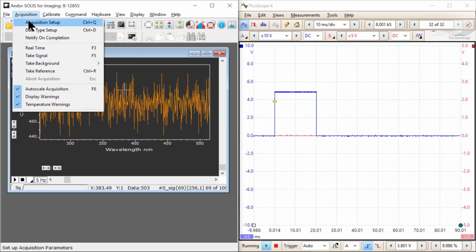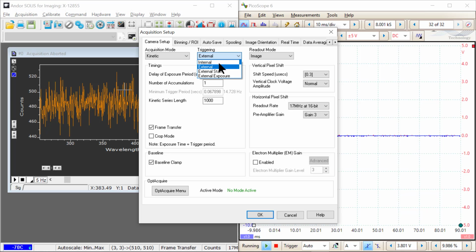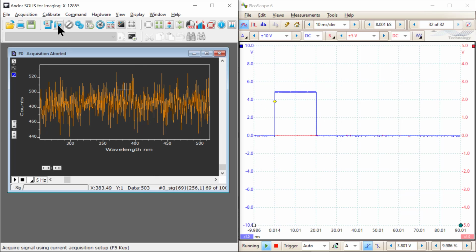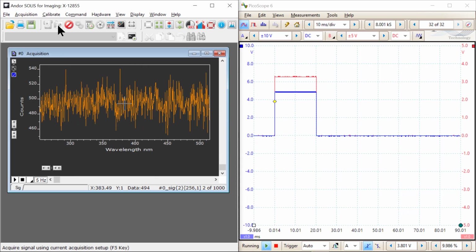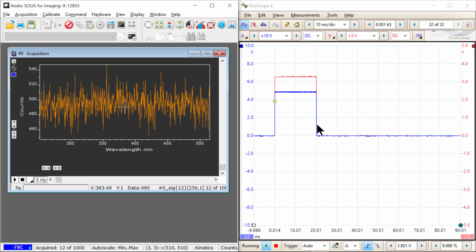So what I can do is switch to a different mode if I want to actually define formally my acquisition time, or my exposure time, just from the trigger pulse. What I can do is use the external exposure mode. This had a flash bulb, I think, at one point that showed what it was doing, but you can see that the frame transfer info has gone away. So I can only do this in non-frame transfer mode. And let me see what the timing consequences of that are.